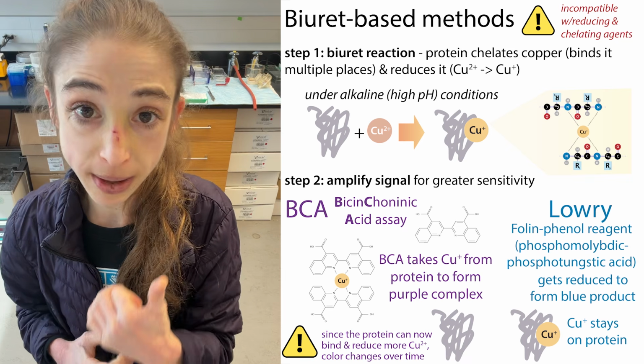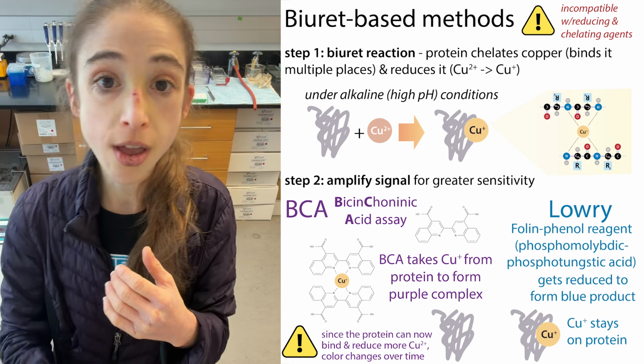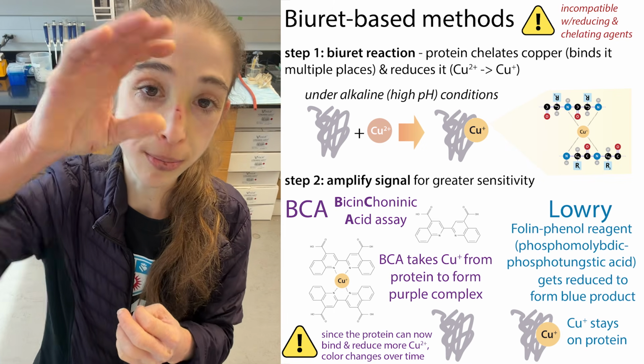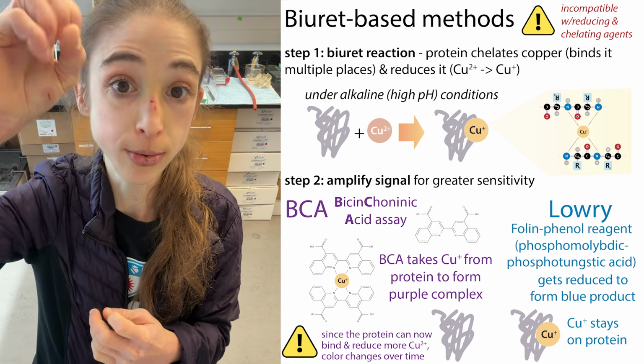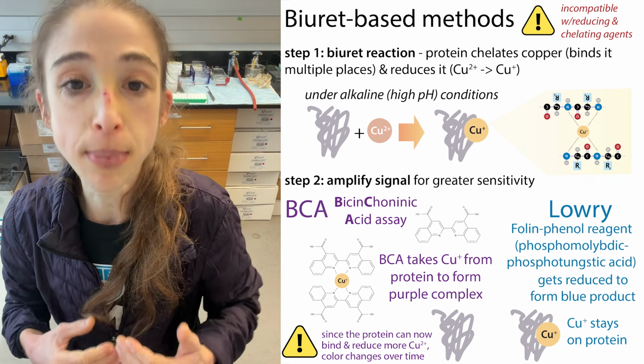These Biuret-based methods measure based on the protein backbone, not by globbing on to the protein side chain or by measuring absorption from the protein side chain. Instead, these are dealing with the backbone, so it makes them less biased.